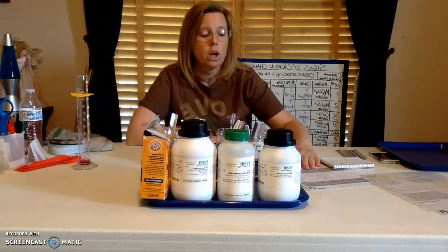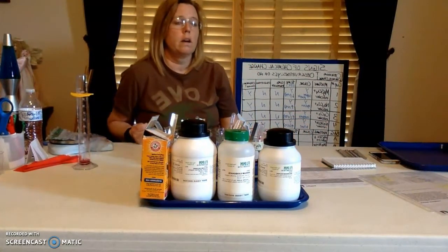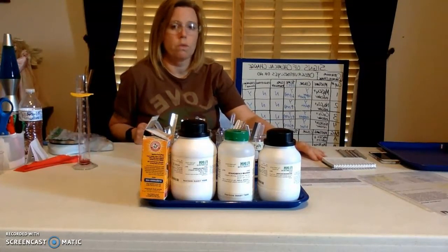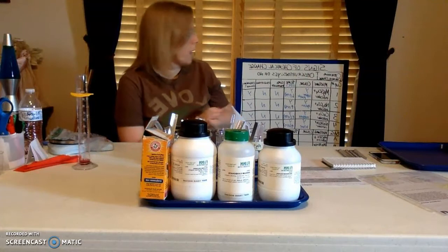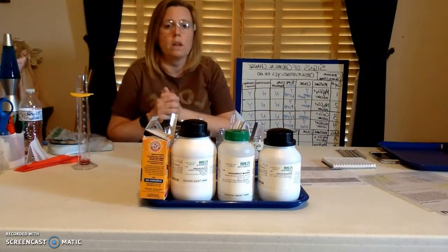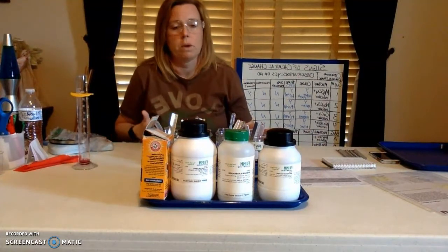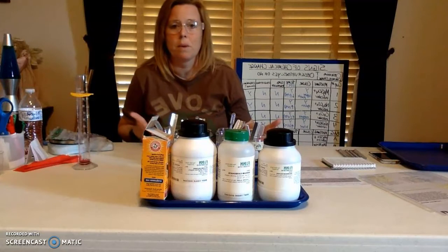The data table that you will see that is behind me, I will take a picture of this and post this in Classroom. It is going to go through some of those maybe more obvious and maybe not so obvious chemical reactions. So we have color, temperature, gas produced, precipitate formed, and then of course finally the last column of that data table would be if a chemical change has occurred. You are going to see a chemical reaction.